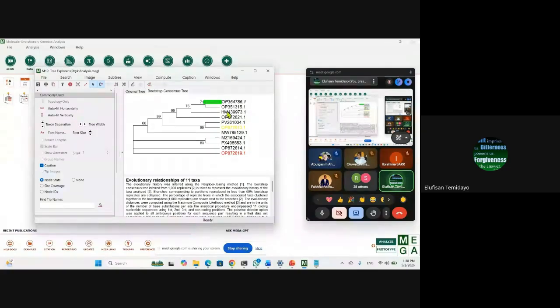If you want to italicize, either do it on iTOL, or you do it in an SVG annotation tool or an SVG editor, something that can open an SVG file. So you can do it in that place. So that's one thing you could do.